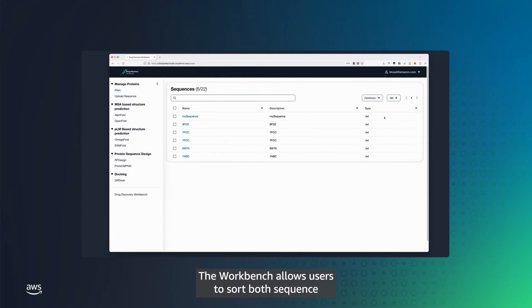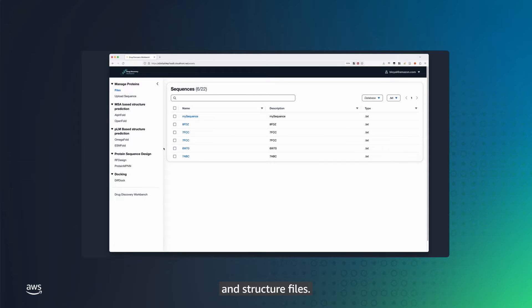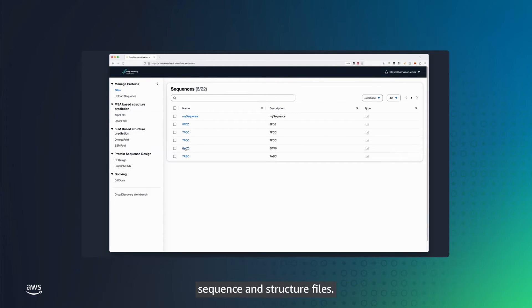The Workbench allows users to sort both sequence and structure files. Here, you can see all of the sorted sequence and structure files.